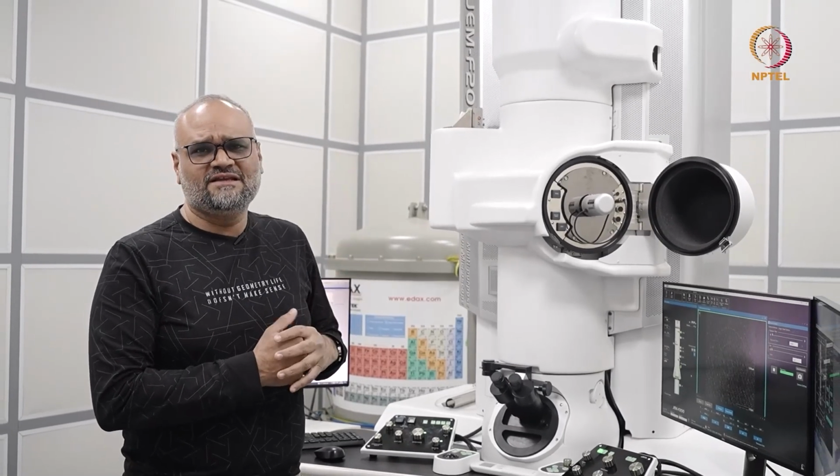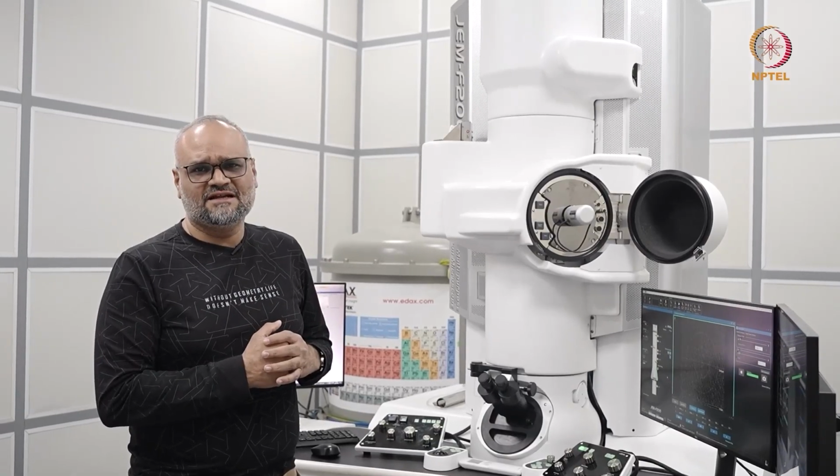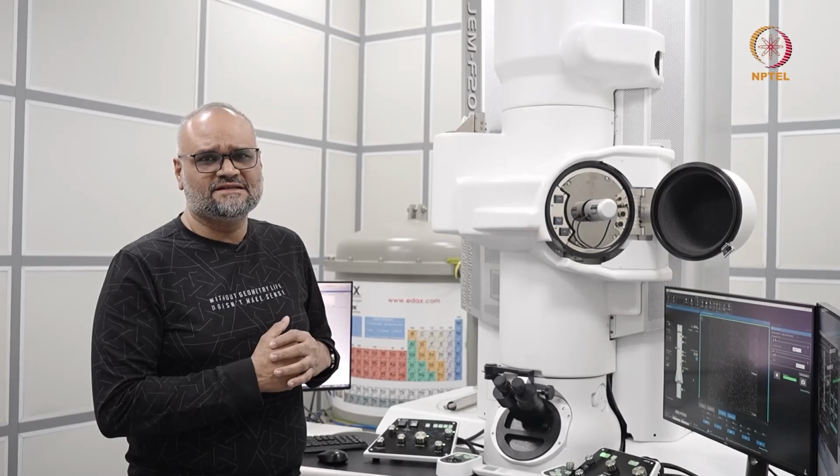So here we have the JEOL JEM-F200 microscope. It's a cold field emission gun TEM operated at 200 kV. This instrument is also equipped with an EDS detector.